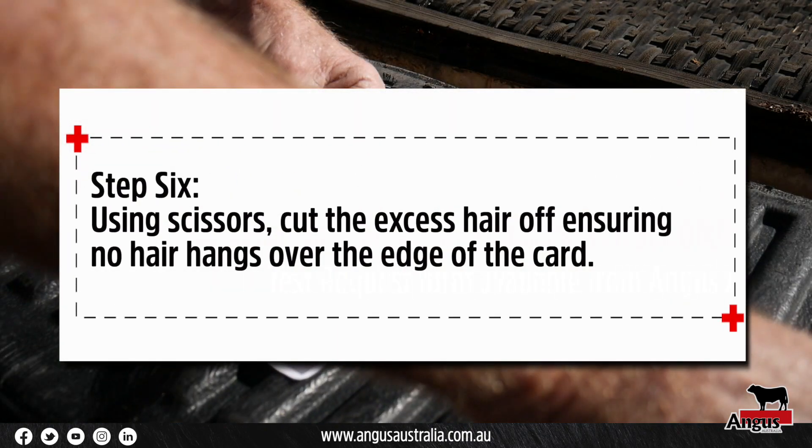Using scissors, cut the excess hair off, ensuring no hair hangs over the edge of the card.